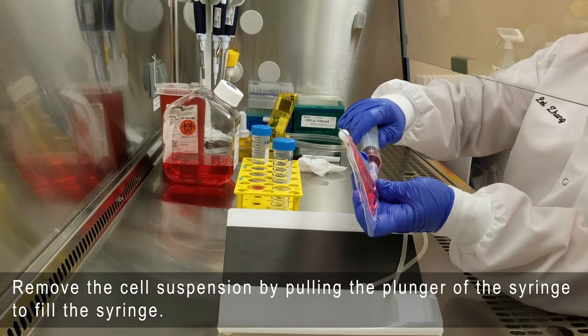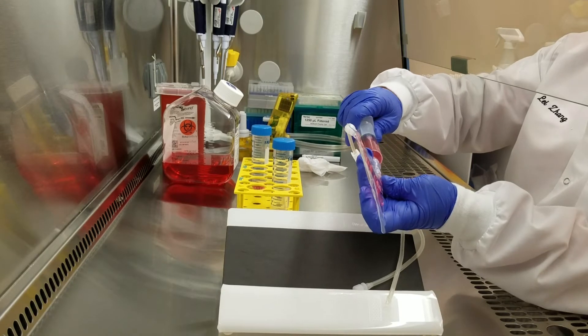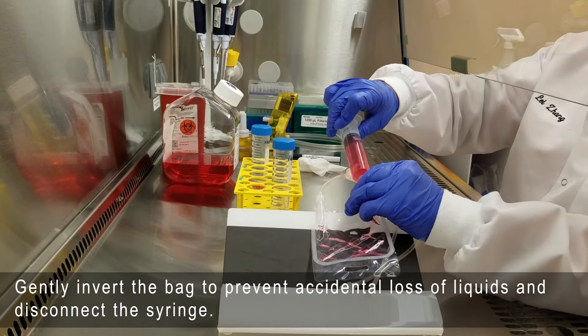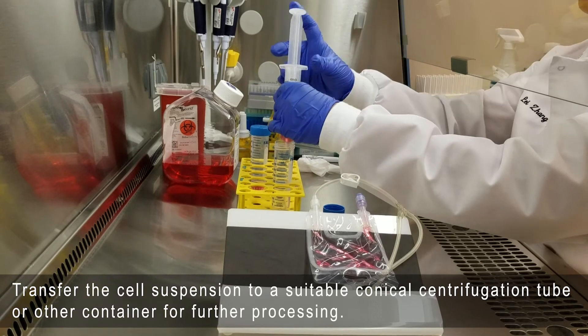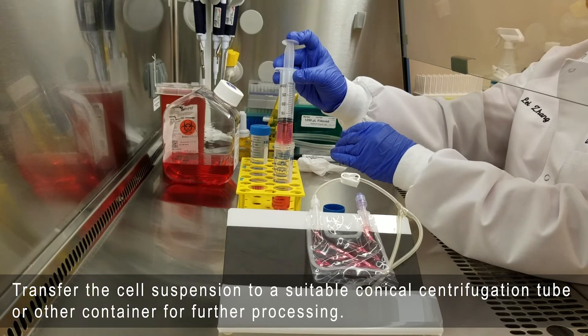Remove the cell suspension by pulling the plunger of the syringe to fill the syringe. Gently invert the bag to prevent accidental loss of liquids and disconnect the syringe. Transfer the cell suspension to a suitable conical centrifugation tube or other container for further processing.